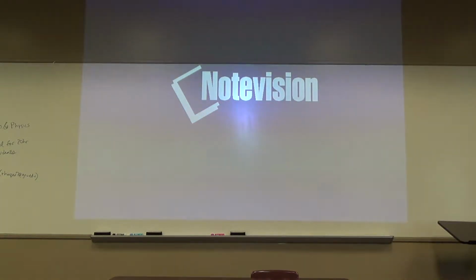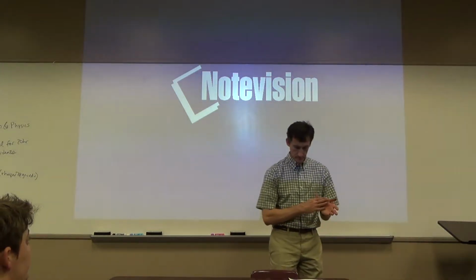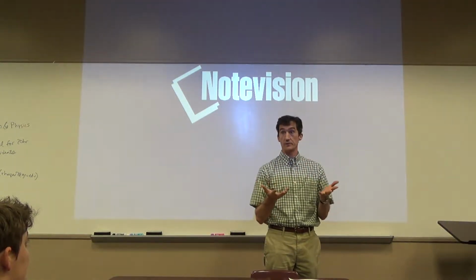Okay, infrared spectroscopy. Infrared spectroscopy, a type of spectroscopy.